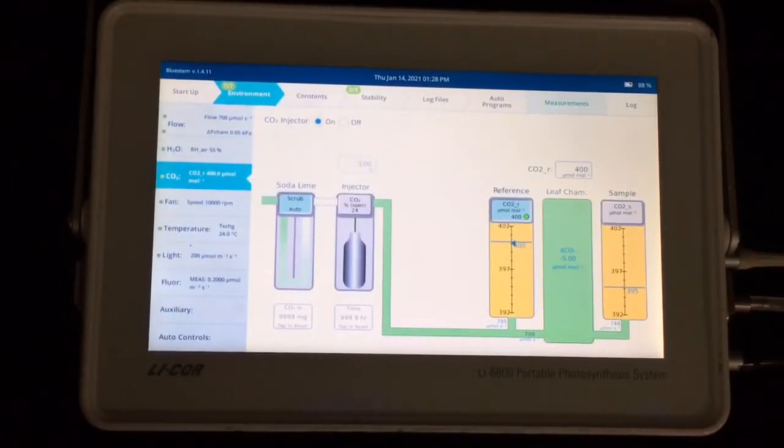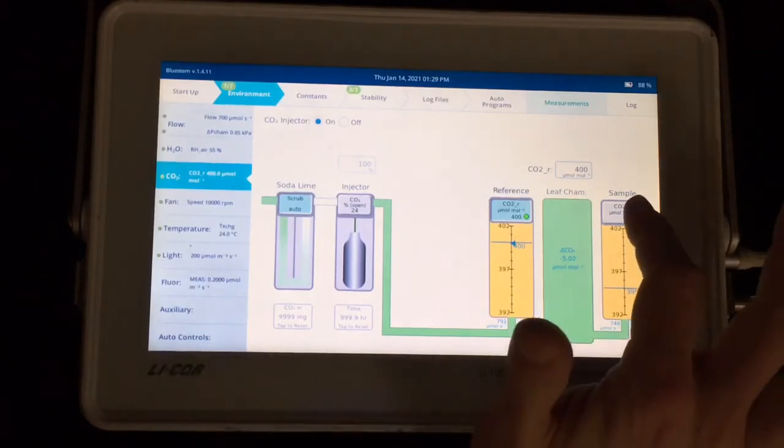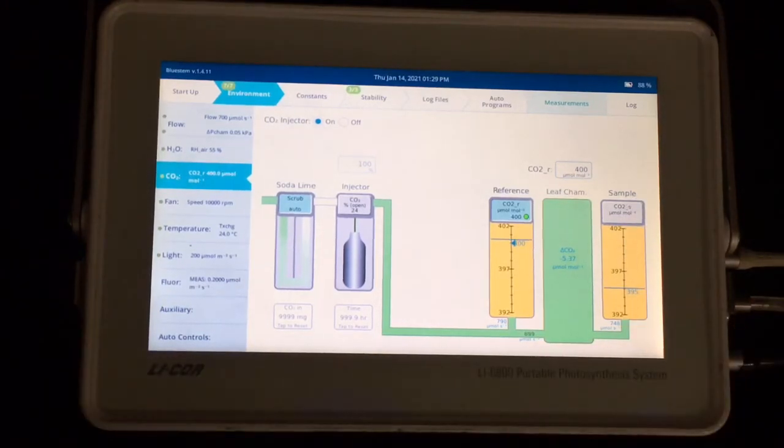Another important consideration is your CO2 concentration. Typically, you'll work around ambient, so around 400 ppm. And again, a choice is to control on the reference, so on the incoming airstream or on the sample. Again, if you control on the sample, CO2 sample, it will take a few seconds longer to reach stability once you've closed that chamber. But you'll be guaranteeing the same concentration around your leaf for every single measurement.